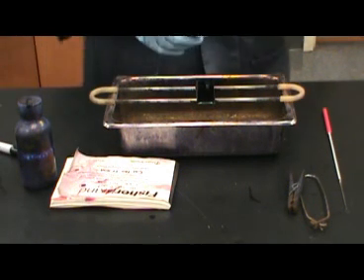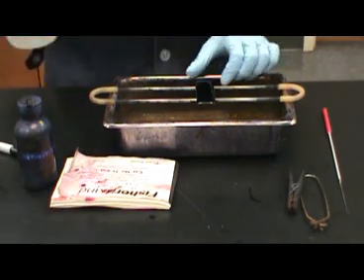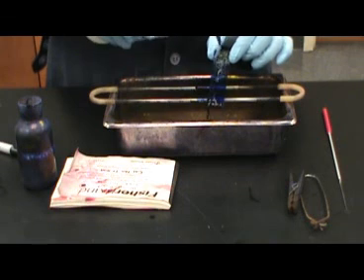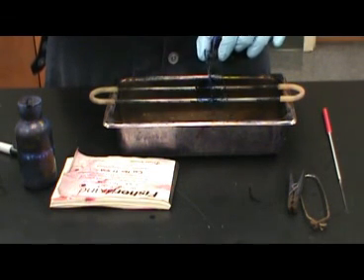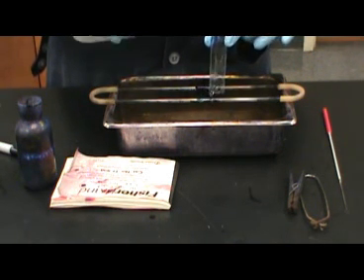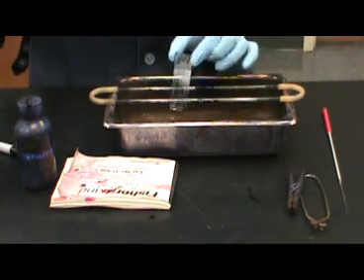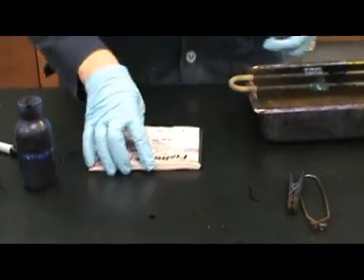Once the stain has been left on the slide for 2 to 3 minutes, you are ready to begin rinsing. For simple staining, the rinse solution is just water. Allow the water to gently run down the slide until it comes off of the slide a clear light blue. It is also helpful to rinse any stain adhering to the back of the slide off. When you have completed rinsing the slide, you are now ready to dry it.